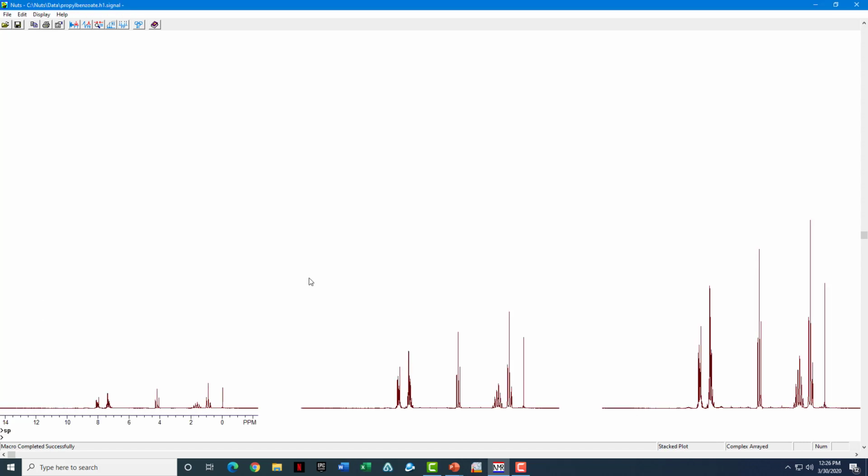We'll notice that we get 3 spectra. The 3 spectra are the results of 3 different experiments where on the left we did a single scan, in the middle we did 4 scans, and on the right we did 9 scans. So we're going to see how the signal changes depending on how many scans you did. Let's look at one peak at a time though.